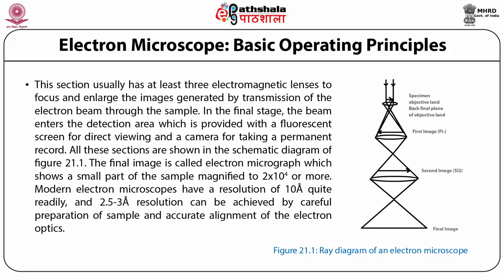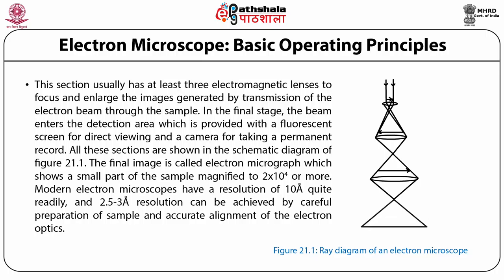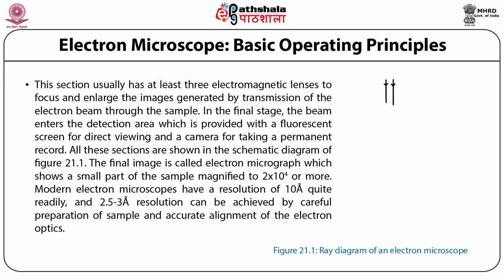The final image is called an electron micrograph, which shows a small part of the sample magnified to 2 into 10 raised to power 4 or more.